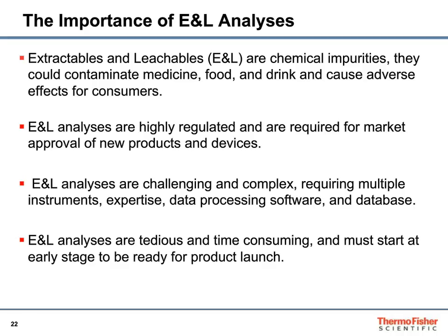So why is extractable leachable analysis important? Because they are chemical impurities. They could contaminate the medicine, food, and drink, and cause adverse effects to consumers, especially the biological drug. Mostly administered through injection or infusion, so they get into the human circulation system in just a second. So that's why it's so important to make sure the container packaging we are using for the medicine is safe.